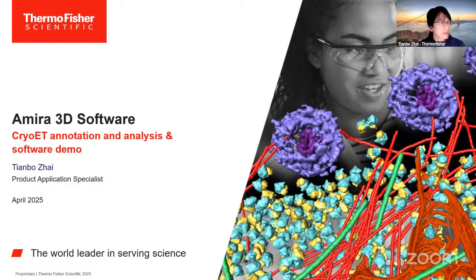Along the process, I will be using a couple of cases to demonstrate how the annotation is done inside the software, what the analysis looks like, and of course, a general overview of the software, in case you are not as familiar with AMIRA or even new to image analysis in general.